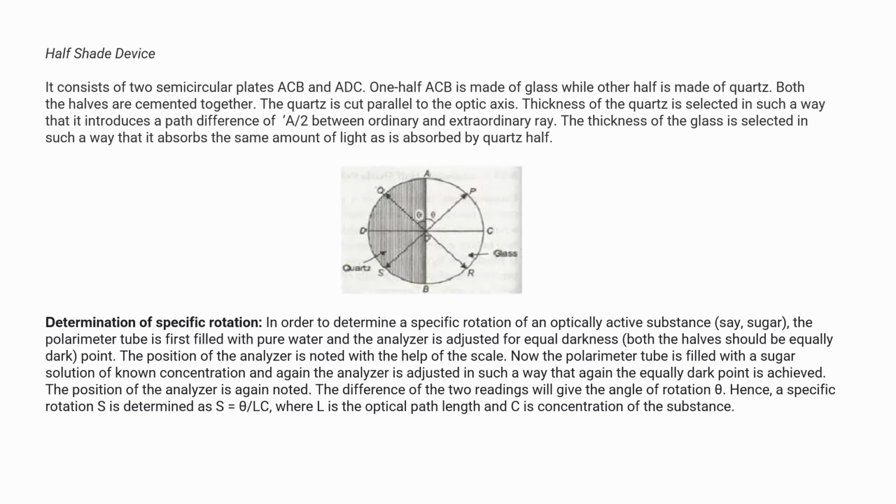The difference of the two readings gives the angle of rotation θ, and the specific rotation is given by θ/LC, where L is the length of the optical path and C is the concentration of the substance.